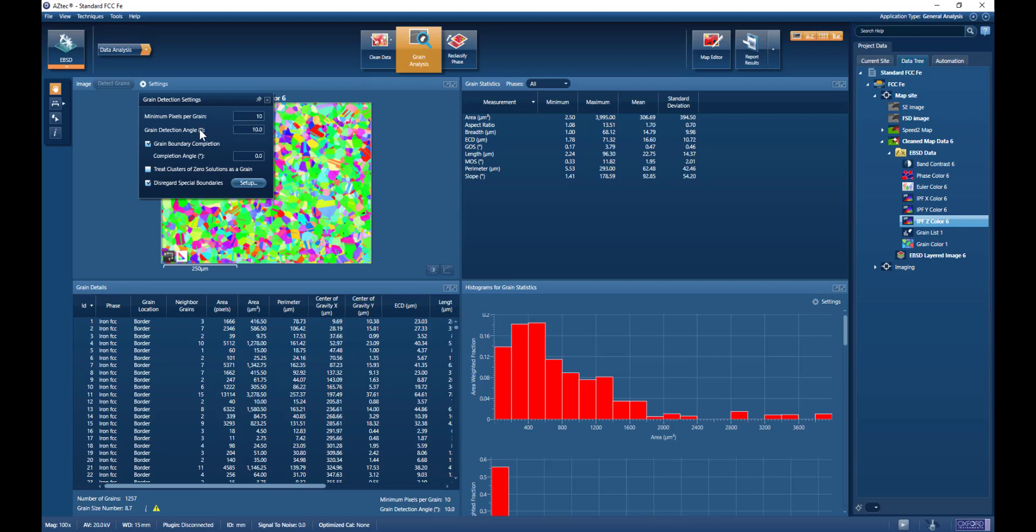We have the grain detection angle, so this is the threshold angle above which will be considered as a grain boundary.